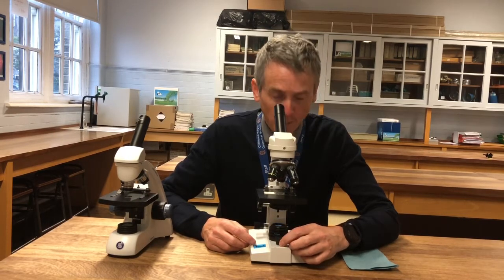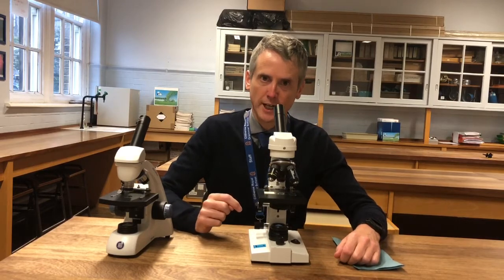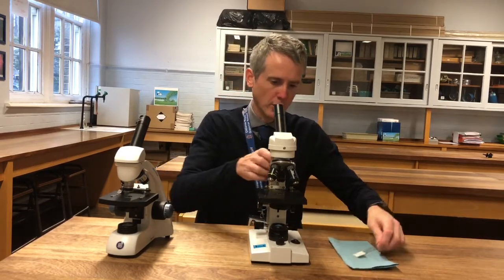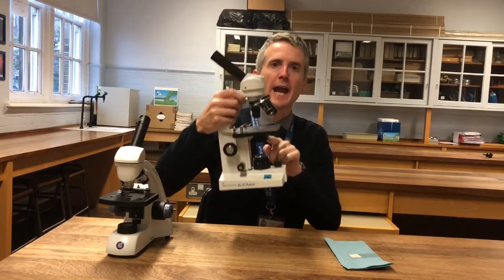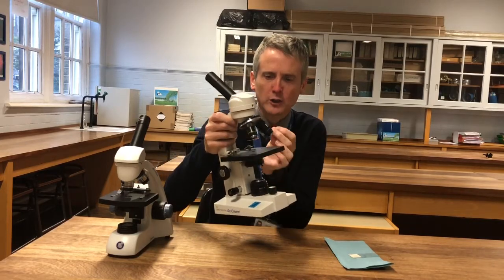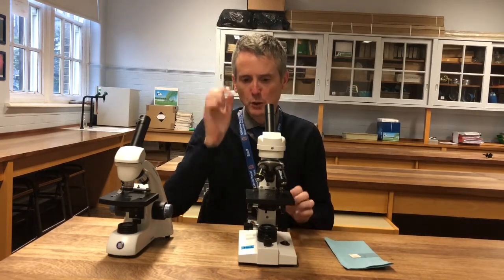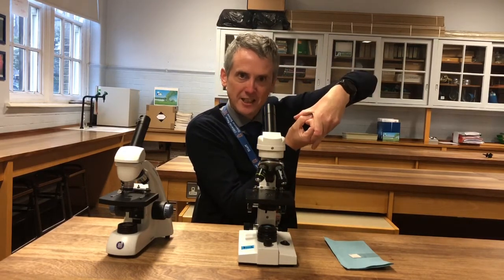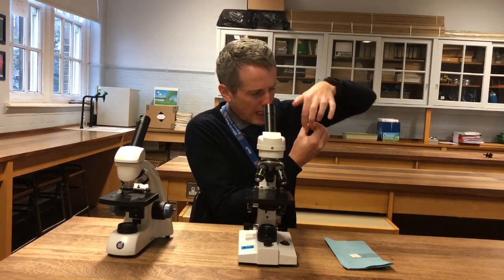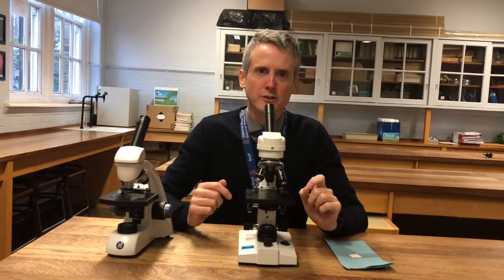That's the most basic way of changing the light that comes through a microscope. However, there's another way to change the behaviour of light. Underneath the stage is a condenser. This changes the behaviour of light — it has lenses in it that focus the light through the specimen. There's a little iris there as well, like we have an iris that controls the size of our pupil. There's an iris that you can open to let lots of light through, or close to let less light through. When there's a small aperture, less light can come through.